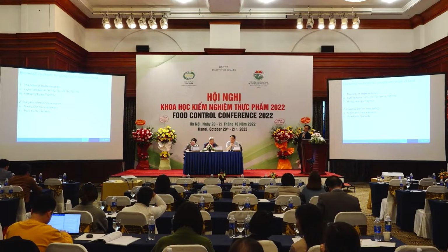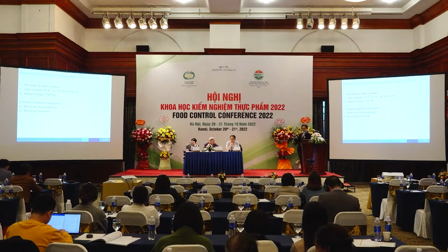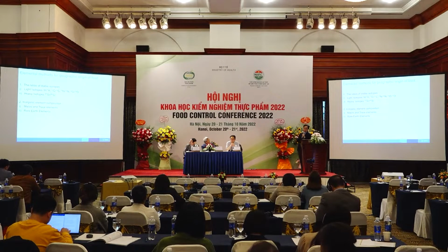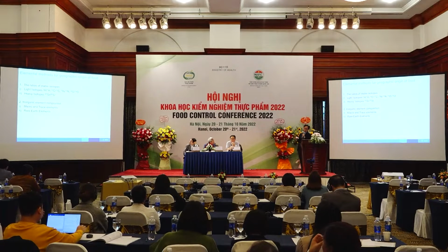These are associated with the climate in certain areas, so the isotopes may vary according to different geographical places. We can also look at heavier isotopes like strontium isotopes to identify where food is coming from.